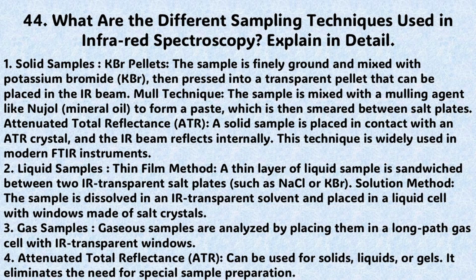The next question is question number 44. What are the different sampling techniques used in infrared spectroscopy? Explain in detail. The answer to this question is very simple. Different sampling techniques are used depending on the physical state of the sample.